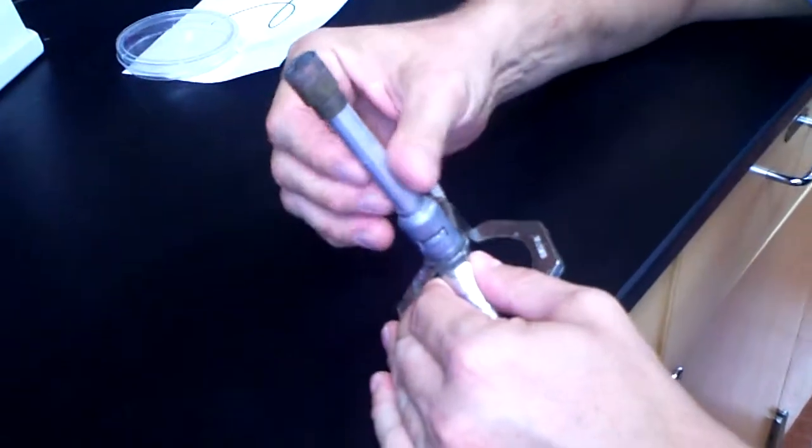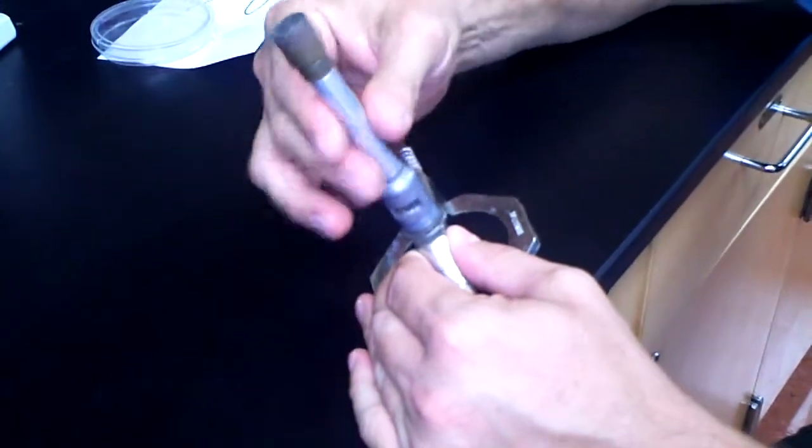So this is the Bunsen burner. When you disassemble the barrel, you unscrew the barrel.